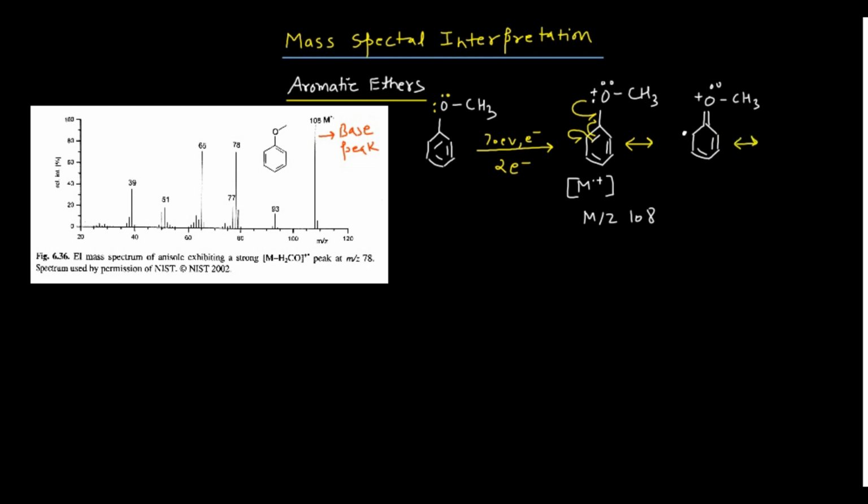So now what you can do, you can break this particular bond, right? One electron will come here and another electron will go there, and one electron is already there. So your double bond will shift in that case. Like that only. So this is again a double bond oxygen with one lone pair and CH3 with a positive charge over there, and one double bond here, one double bond here, and an odd electron.